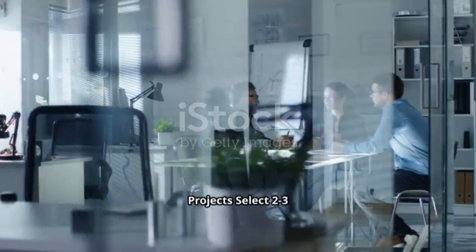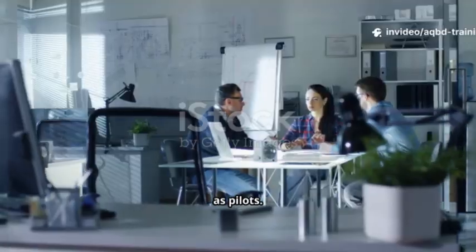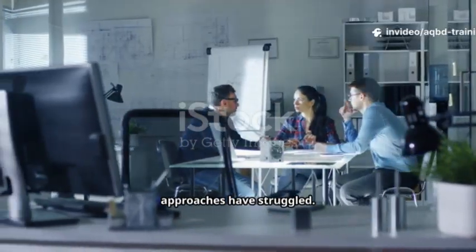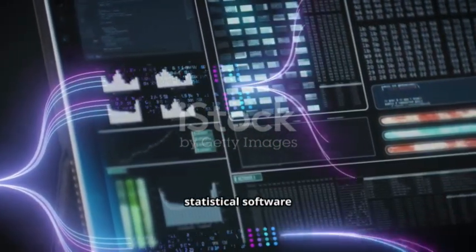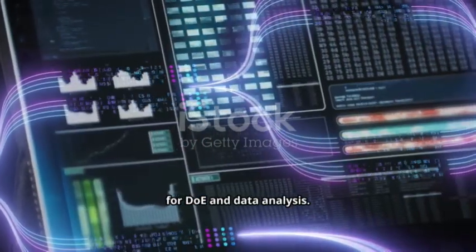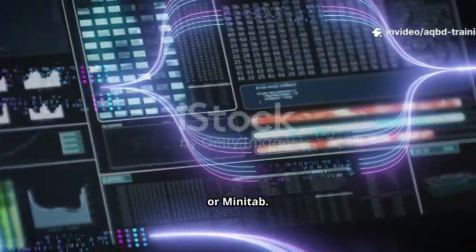Phase 2, pilot projects. Select 2, 3 simple method development projects as pilots. Choose methods where traditional approaches have struggled. Phase 3, tool implementation. Invest in statistical software for DOE and data analysis. Popular options include JMP, Design Expert, or Minitab.